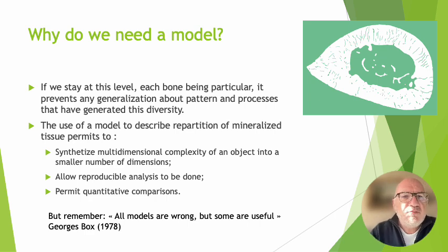If we stay at this level, each bone being particular, it prevents any generalization about the pattern and processes that have generated this diversity. The use of a model to describe repartition of mineralized tissue permits to synthesize multidimensional complexity of an object into a smaller number of dimensions, allow reproducible analysis to be done, and permit quantitative comparison. Just at this point, it is always good to remember that this is a model, and as George Box said in 1978, all models are wrong, but some are useful. And I hope that BoneProfileR is a useful model to describe diversity of mineralization of bone sections.